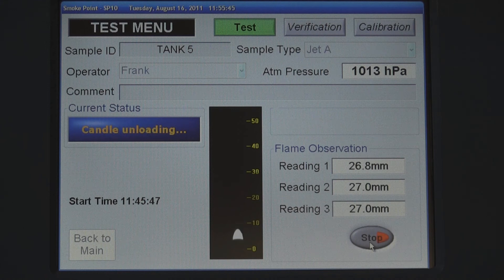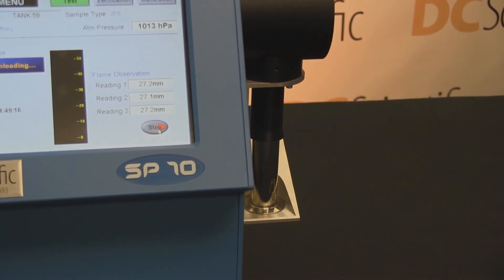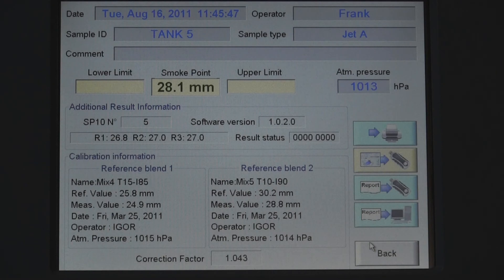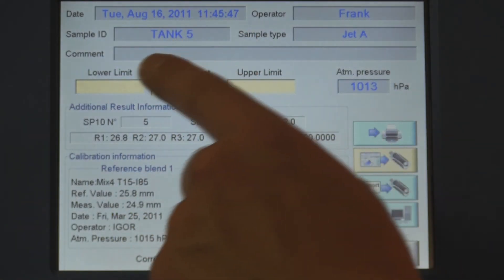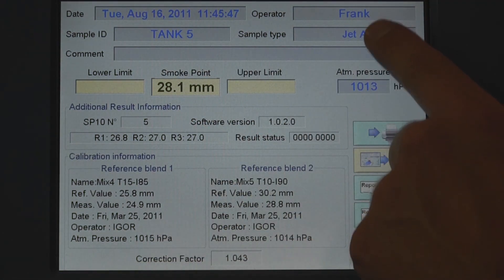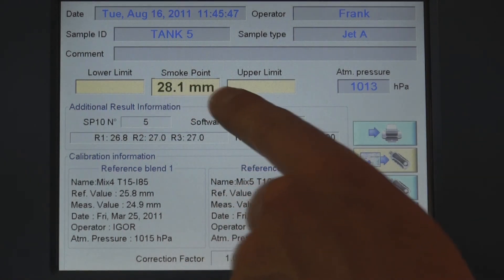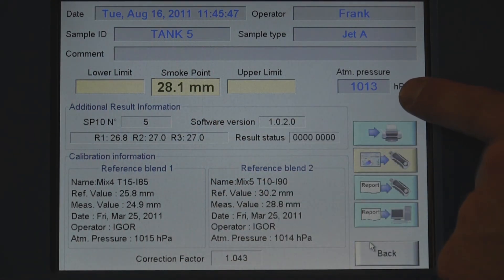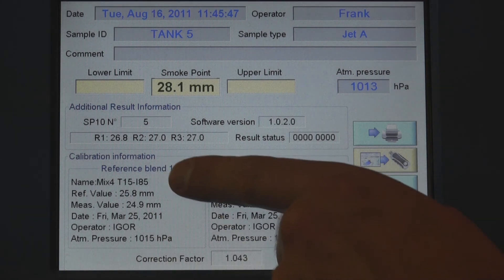The candle is automatically extinguished and lowered to the rest position. When the third and final measurement is completed, the date, sample ID, operator, and sample type are displayed. The analyzer averages the three measurements, applies the barometric pressure correction, and displays the reading including all calibration information.